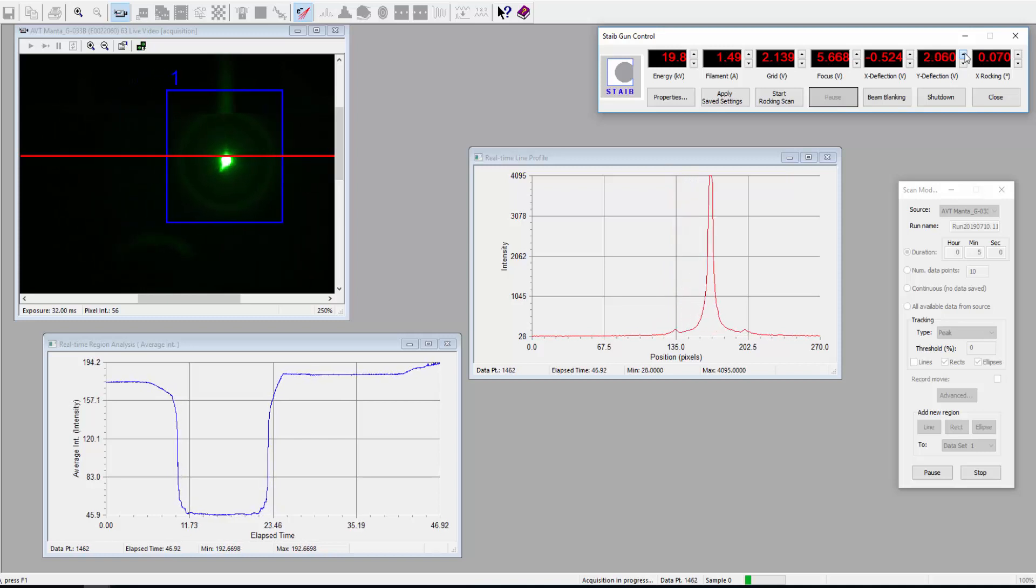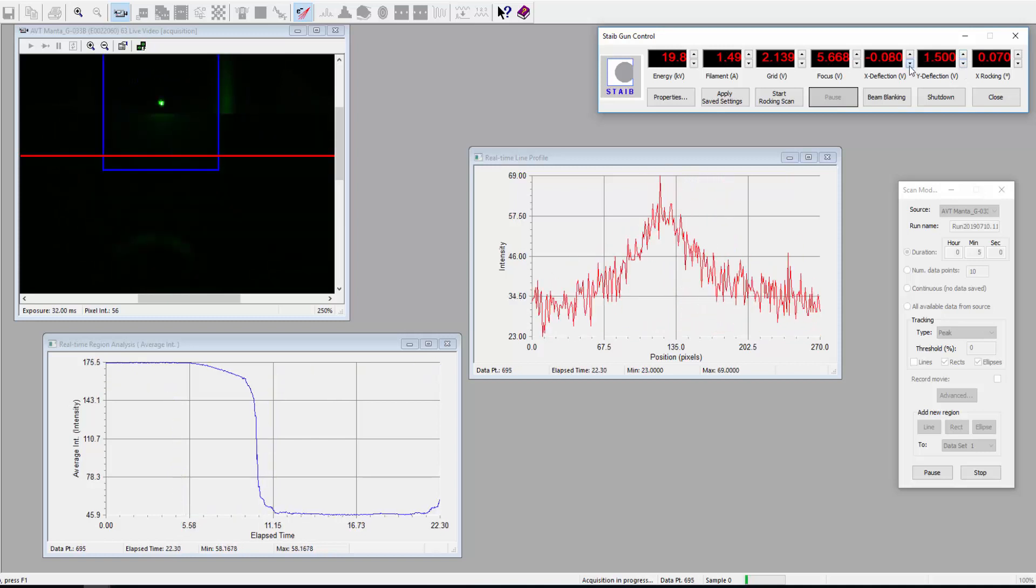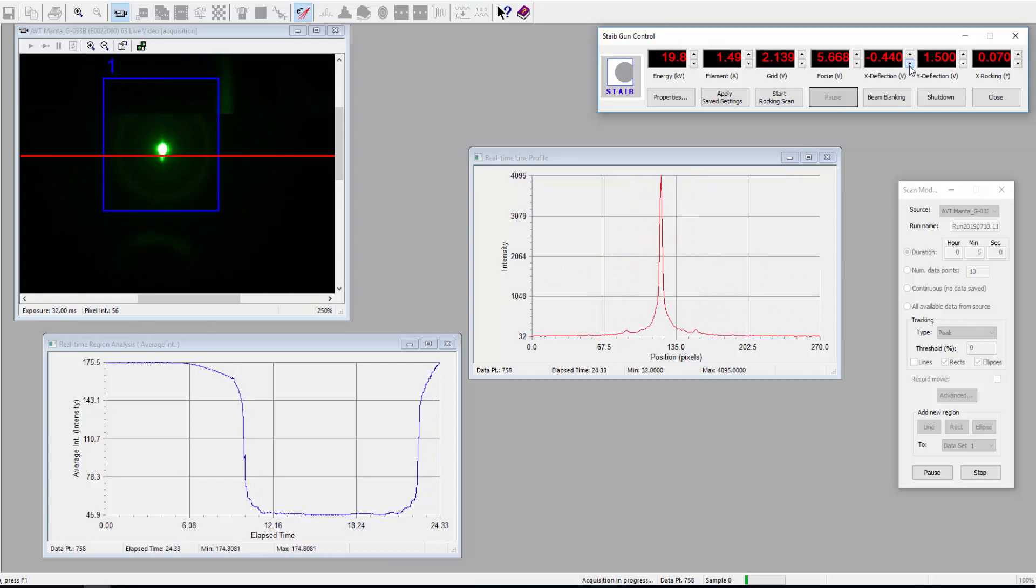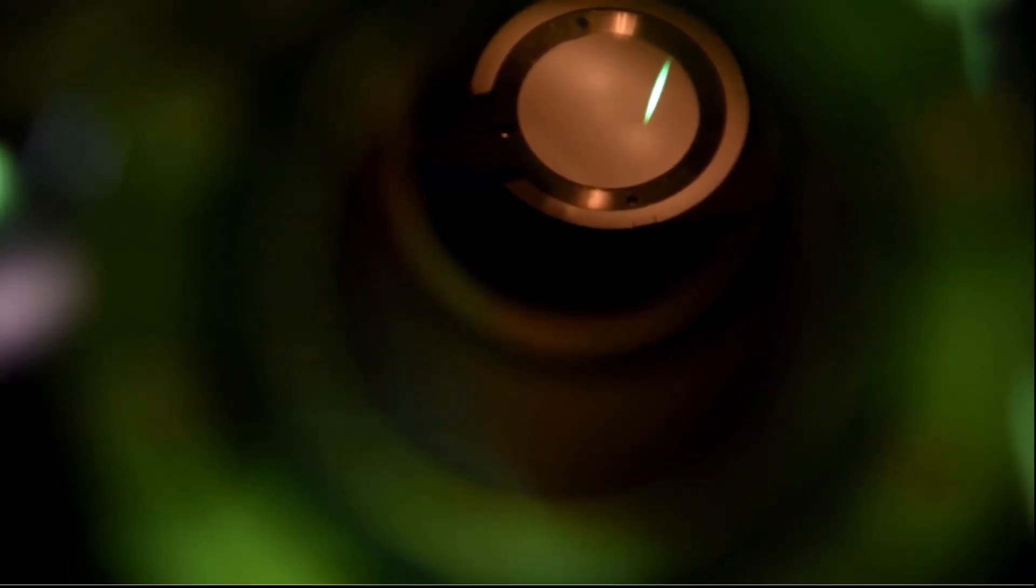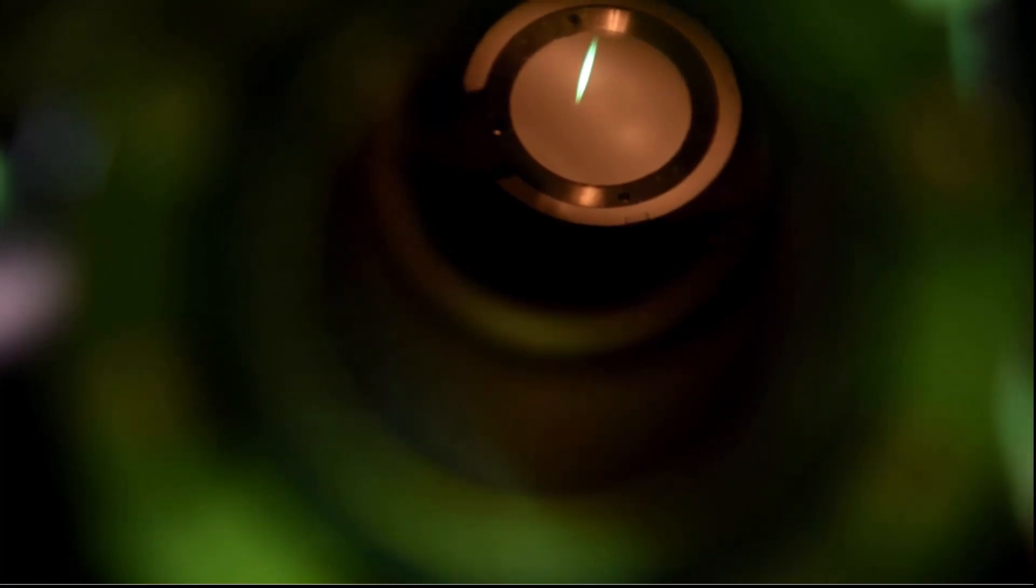Here you can see our KSA400 software being utilized to rock the electron beam to the proper alignment. It can be used to rock the beam along both the Y and X axes.